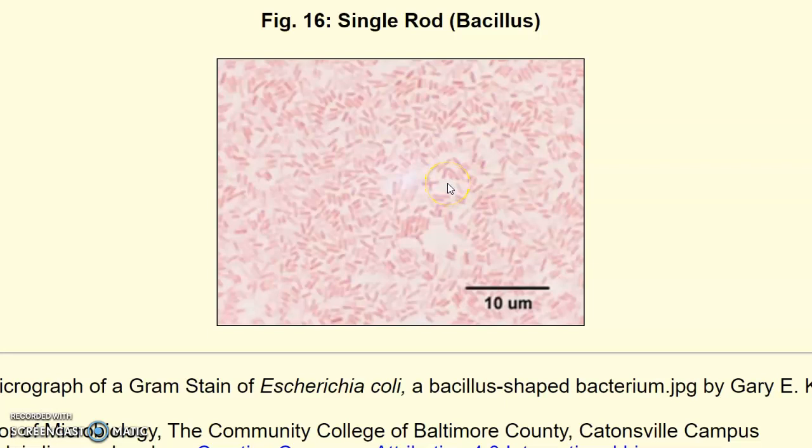Now, the thing that you have to keep in mind about Bacillus is, if you see Bacillus or Bacilli written non-capitalized, not in italics, we're referring to the shape. We have a genus, an actual scientific group of rod-shaped bacteria that go by the name Bacillus.